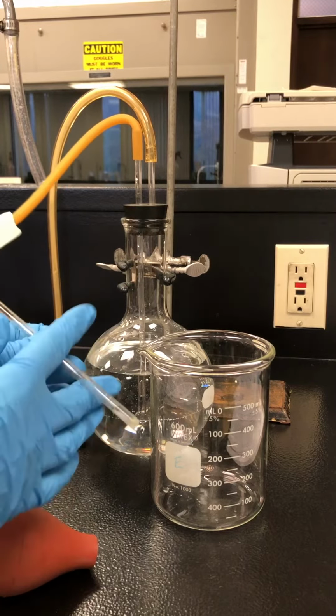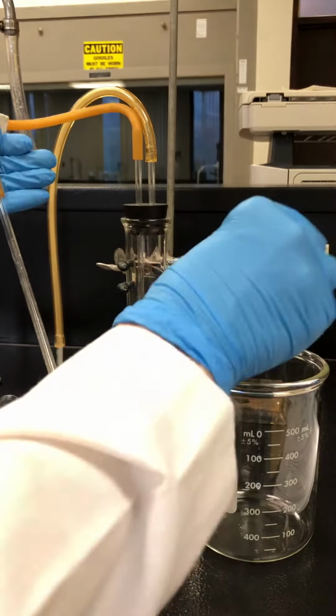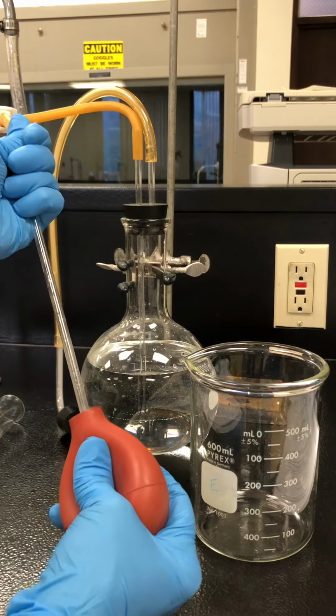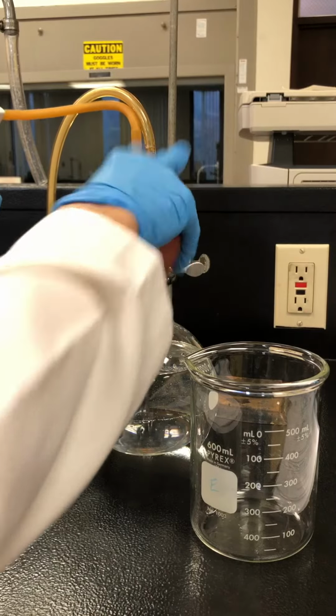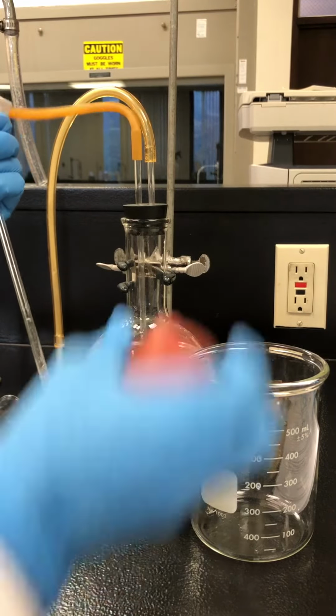So I'm going to squeeze the bulb and put it at the end of my line. And I can see it's moving a little bit, but my goal is to get it such that there is no air in there at all. And sometimes I can catch it part of the way by closing it with my fingers. There we go, almost perfect.